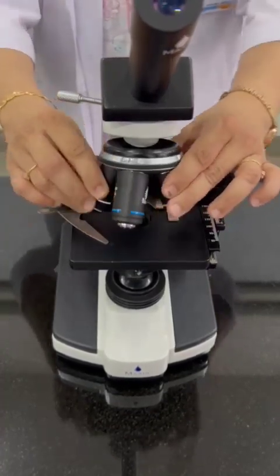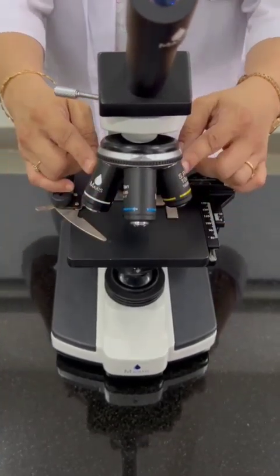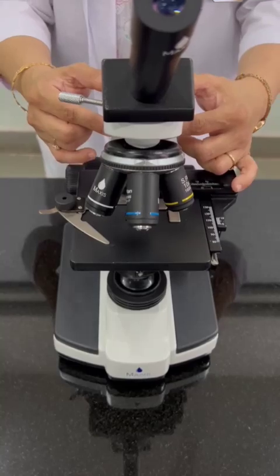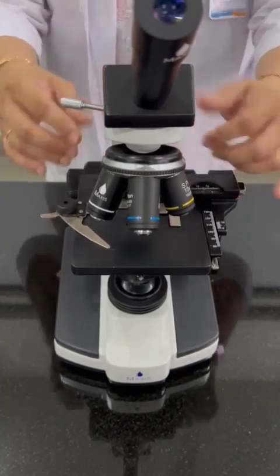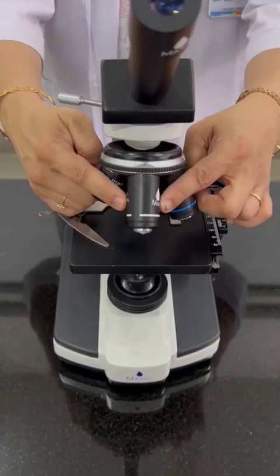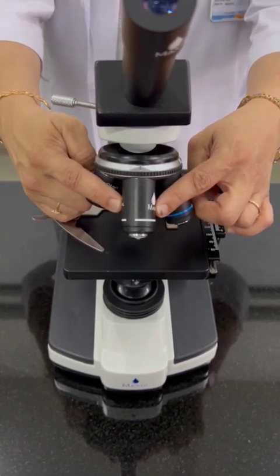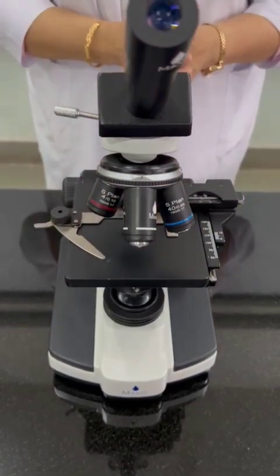Then we have the high part, which is indicated by a blue ring, which may be 40x, 45x or 60x, again depending upon the manufacturer. And lastly, we have the highest magnification, 100x, called the oil immersion objective. So what is the purpose of this objective?